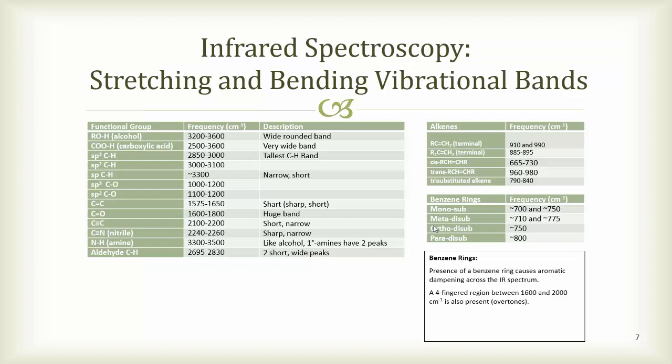When interpreting an IR spectrum, you will need to look for evidence of all the functional groups that are present and all that are not present. Often IR spectra will be used with other types of spectroscopy to determine more complex molecule structures. In this class, you will only focus on IR spectroscopy with simple samples. In the following slides, I will refer to the different bands that you should observe for different functional groups, and I will have examples of each of these.